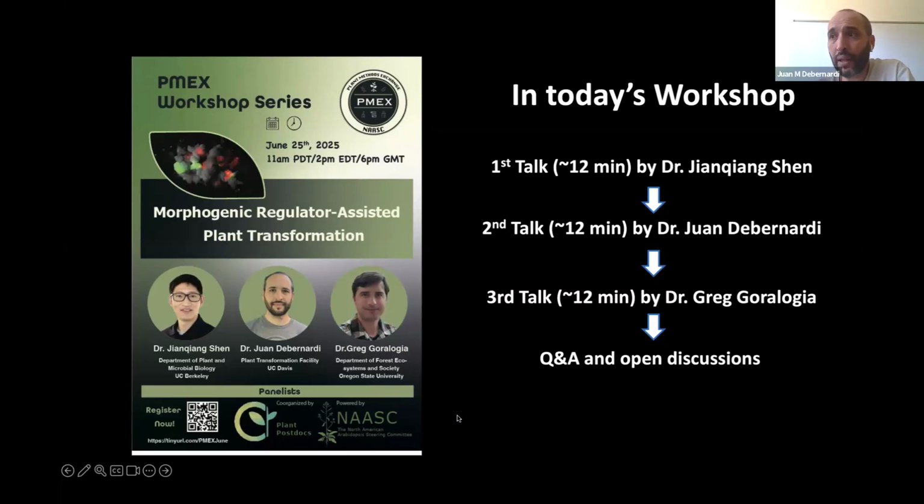And as I say, we have this version that we have tested in Arabidopsis and in different dicots. And I know the Chinese group just published a different DEX inducible GRF-GIF. Instead of cloning the GR domain in between GRF and GIF, they put it upstream, at the N-terminal of the GRF gene. They used that because they found that in some tetraploid wheat, GRF-GIF produced some sterility. So with that, they can control that.